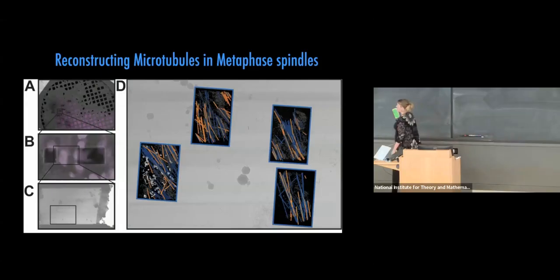Okay, this is just a different picture, where the lamella is very thin, to make the point that in X and Y it's not such a small area. And again, here's the grid. Here's the lamella from the top, right? And here is a lamella where we have fitted in some of the tomograms, right? This also allows us to know our orientation at least a little bit. So we would know, are we close to the pole, closer to the chromosomes, what area are we looking at? Because these fields of view are much, much smaller than anything we've looked at before.